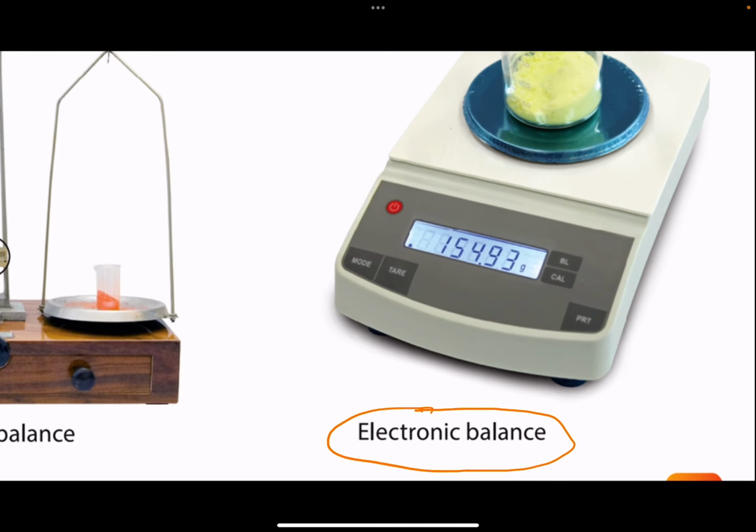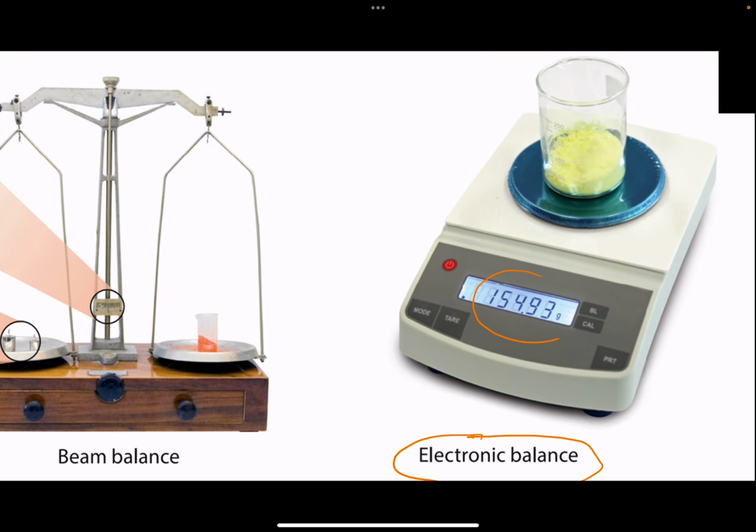Okay, let me just blow this up to show you. So you can see from this particular picture, the electronic mass balance is actually measuring to 2 decimal point. This is actually the one that we use in our laboratory. Okay, some electronic mass balance, they are unable to give such a high accuracy, so they may end up giving us only an accuracy of 1 decimal point instead. Okay, but this is what we have in the lab. All right, so it could be 1 decimal point or 2 decimal point.